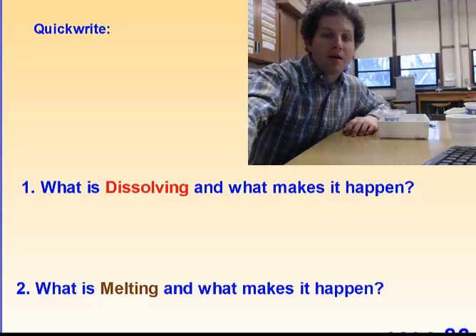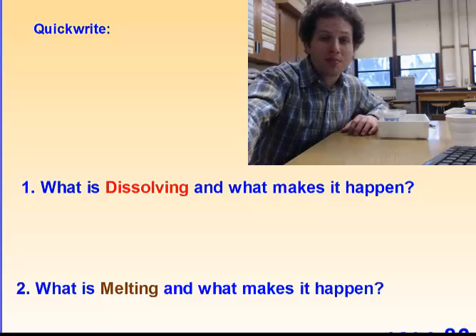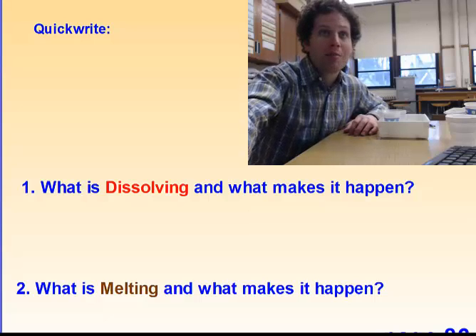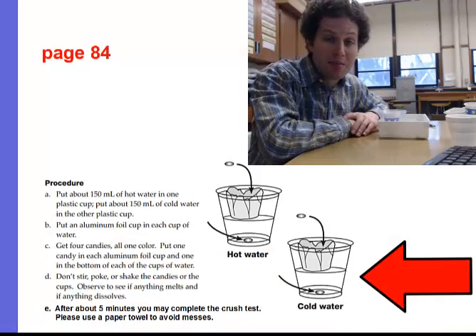For today's lab, you're thinking about what does dissolving mean and what makes it happen, and what does melting mean and what makes that happen. You're going to be doing two series of experiments today, two labs in one day.